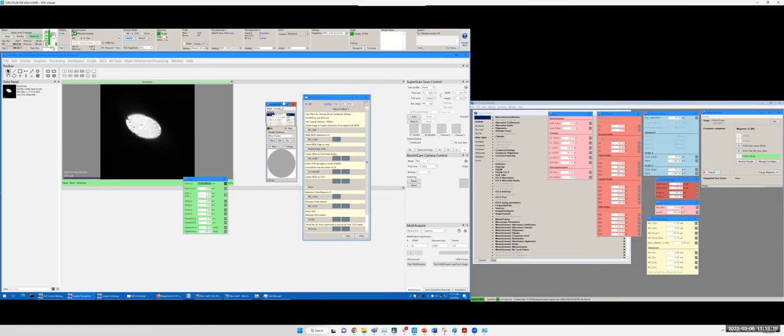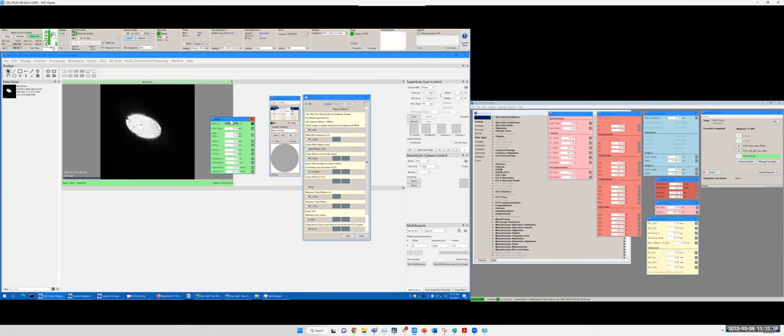Okay, so this is just the alignment, but you want to ask, is there a requirement for such alignment? Yes, so you want to see the effect. What will define the effect? Here I want to emphasize defocus because the Ronchigram is changing over defocus. Currently, you don't see a difference in the Ronchigram because your defocus is so far away. So the first thing you want to do is get to focus.